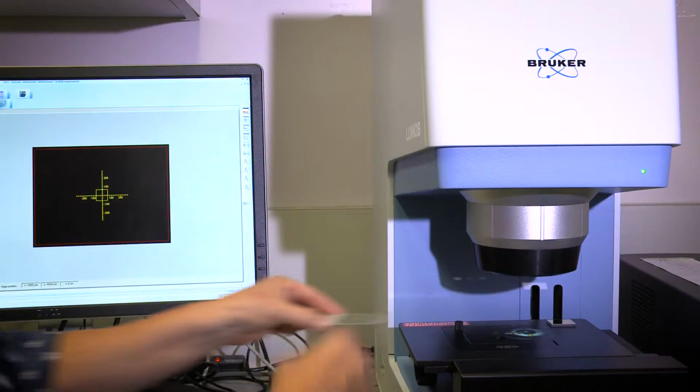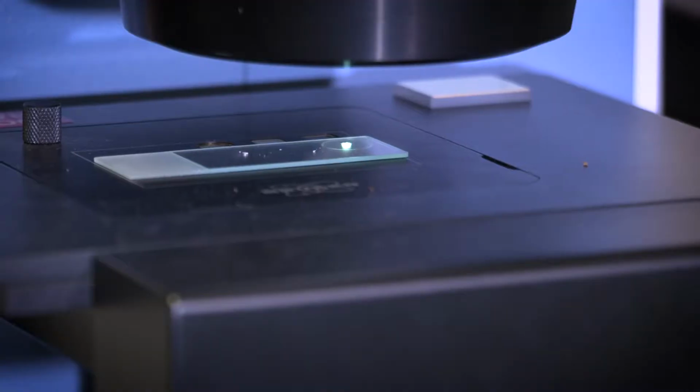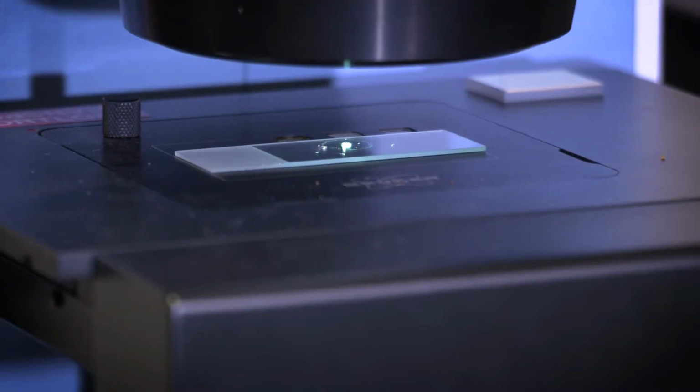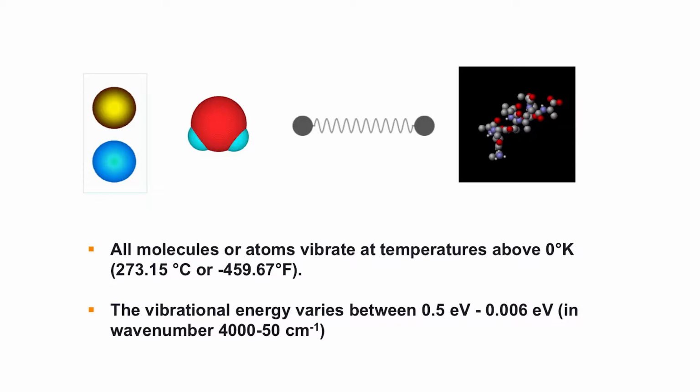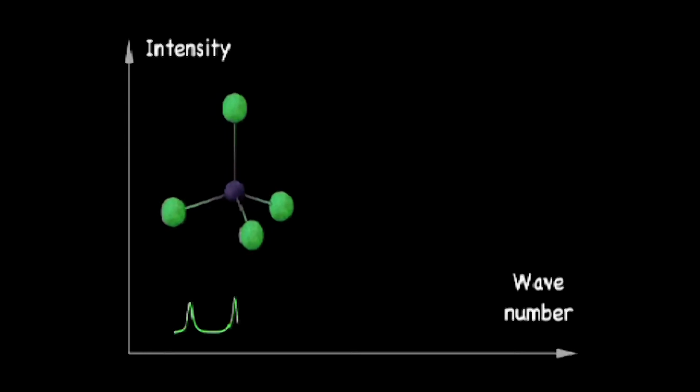I'm Linda Prinsloo. I'm a research fellow here at the University of Wollongong, and I specialize in vibrational spectroscopy. Vibrational spectroscopy is the study of the vibrations of molecules. At room temperature, all molecules are moving around, and if you heat them, they will move at a higher energy. So I can use this to have a fingerprint of different kinds of molecules as they all move at different frequencies, or vibrate at different frequencies, to use a more scientific term.